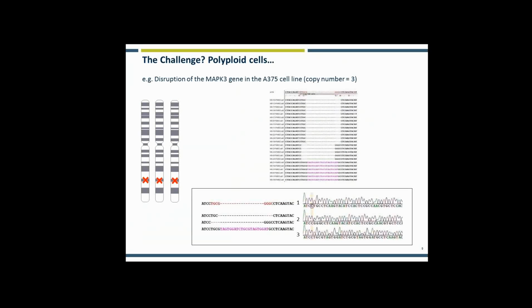So with this in mind, let's move on to today's topic, which is the kind of modifications that you can make in mammalian cell lines. Now, last week I highlighted some of the key challenges to generating any modified cell line. But notwithstanding the efficiencies that you can achieve with CRISPR and also the ease of design, challenges do remain. And a big one of these, at least for us at Horizon, where we're trying to do potentially tens, if not hundreds, of genome editing experiments each month, is the fact that every cell line, or almost every cell line I should say, has multiple copies of your gene of interest.